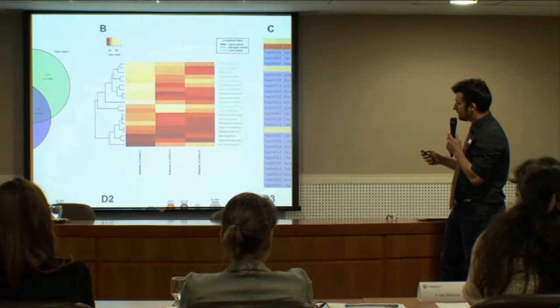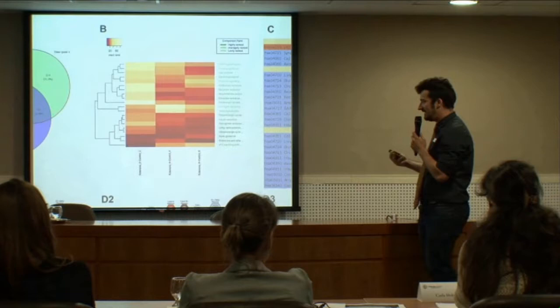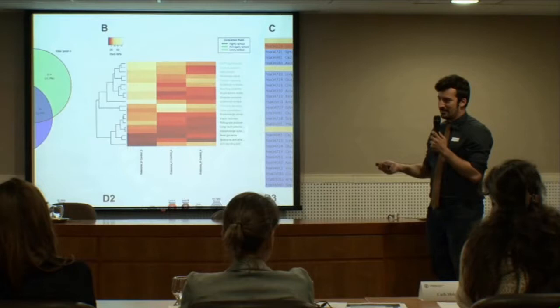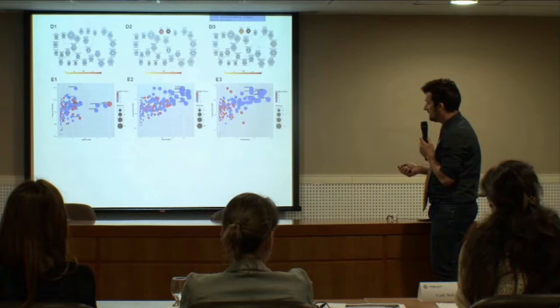In two weeks we didn't see much change. However, at 8 weeks many genes were changed. This is interesting because in toxicology people sometimes say that if you see more genes changed, it's more toxic. However, having fewer genes changed doesn't mean it's less toxic. We did the KEGG pathway analysis, and we chose the pathways with the most significant changes.